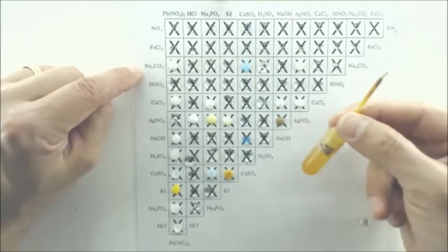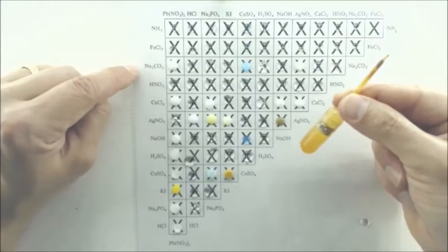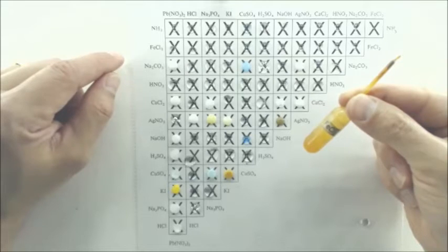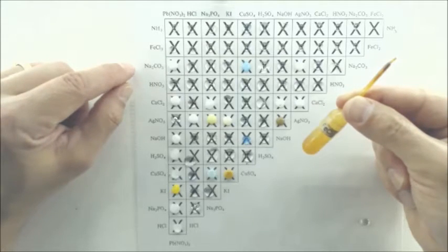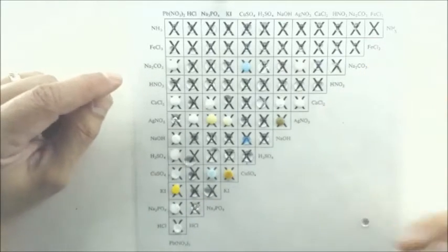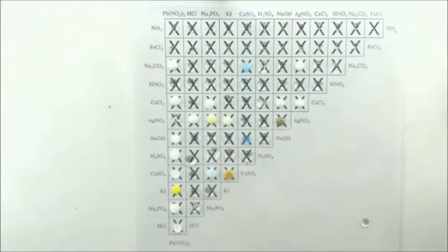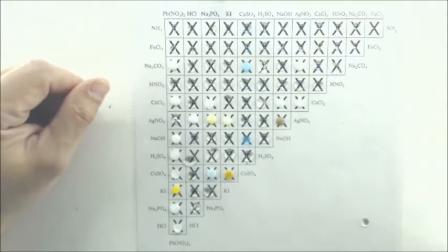Here's our FeCl3. Again, notice the color of the pipette is yellow. For your unknowns, by the way, these are pipettes that have been used for years, probably some of these up to maybe 20 years, to be honest. So anyway, these get kind of cruddy looking after a while. Yours will be a yellow solution, but the pipette won't be as cruddy. That reminds me, back here with the silver nitrate, your pipette will not be this kind of grayish brown dingy color because it's a newer pipette.